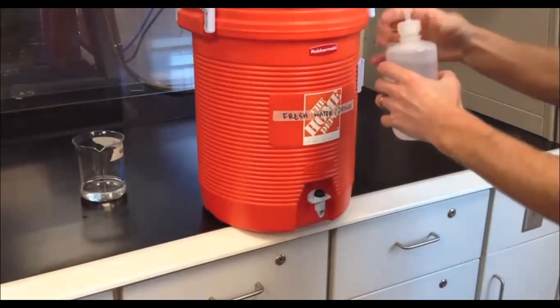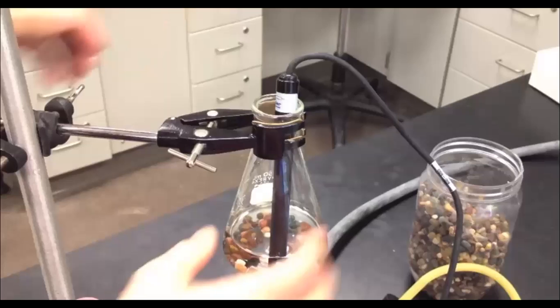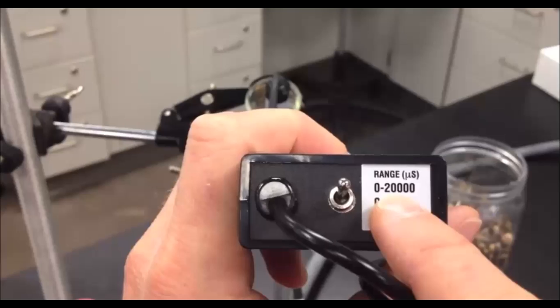Place the rinsed conductivity probe directly into the salt water. Make sure that the tip of the conductivity probe is completely submerged. Right now it's not, so what I need to do is tilt this a little bit so that the conductivity probe is completely submerged. Make sure the toggle switch on the conductivity probe is on the 0 to 20,000 reading. This is because we're measuring salt water, and salt water is going to have a high reading. So we're not going to use either of the lower readings, we'll use the highest reading.